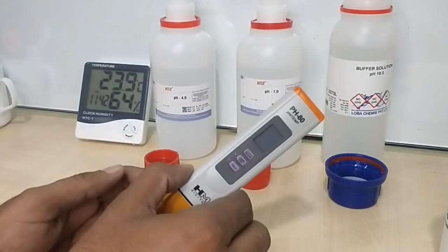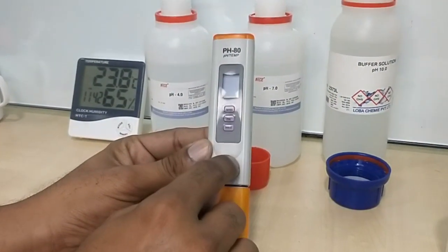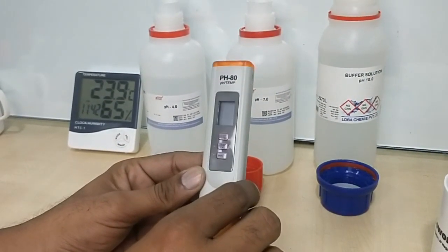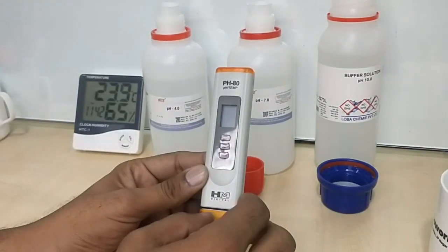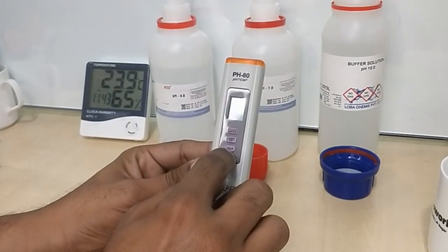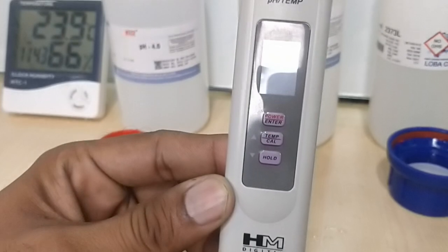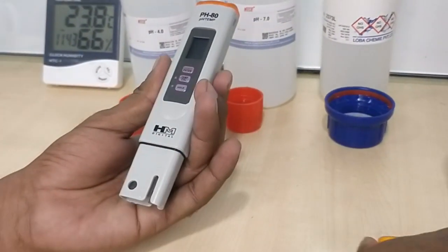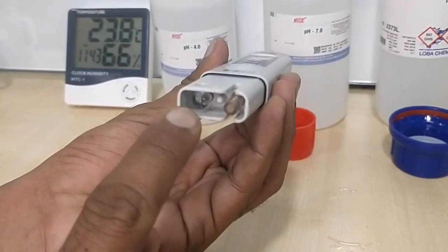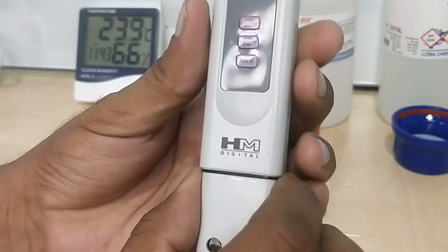Now I'm going to show you how to measure pH with a handheld pH meter. This is a pH meter from HM Digital — there are multiple brands you can choose from. There are multiple buttons: power on, enter, temperature, calibration, and a hold button. Here are the electrodes — this is a glass bulb, also called a glass electrode. You should not store the pH meter dry.